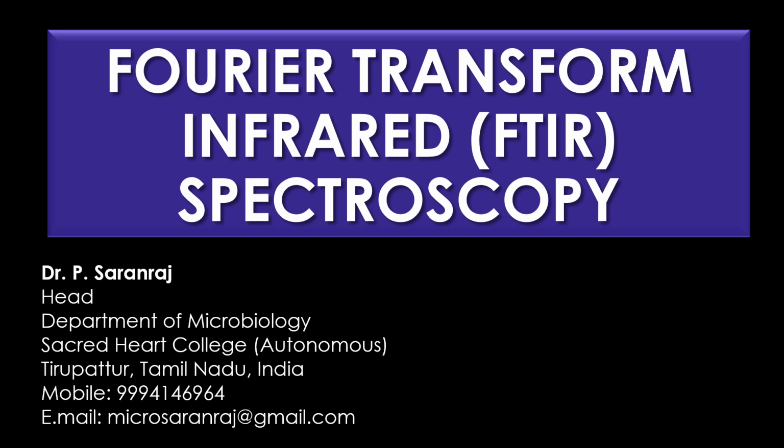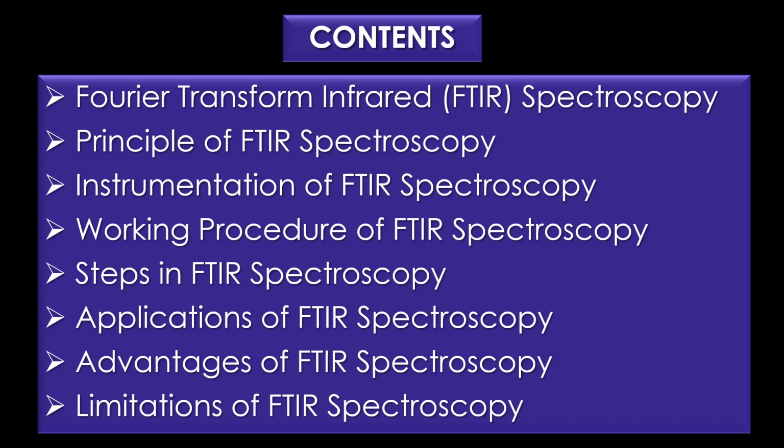Dear viewers, greetings. In this video, we are going to see about Fourier transform infrared spectroscopy. In short form, it is called as FTIR. This video contains the following contents. First, an introduction about Fourier transform infrared spectroscopy, followed by principle of FTIR spectroscopy, instrumentation of FTIR spectroscopy, working procedure of FTIR spectroscopy, steps in FTIR spectroscopy, applications of FTIR spectroscopy, advantages of FTIR spectroscopy, and finally limitations of FTIR spectroscopy.